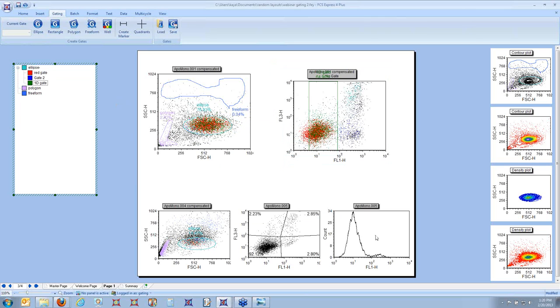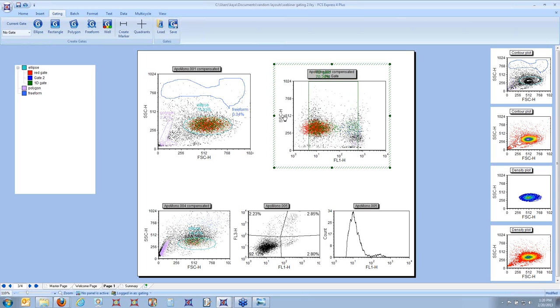All right, so now if I gate this histogram down below on that 1D gate, watch what happens as I move my 1D gate. Do you see the histogram updating? And just to show you, that 1D gate is truly independent of what your y-axis is. So I'm going to change my y-axis on my 2D plot up here to be side scatter. But look, that histogram down below is updating regardless of whatever my y-axis is on the parent plot.